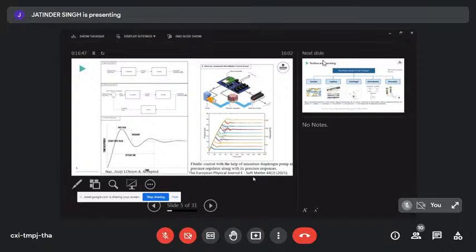And then on top of that, you've got the pulsative system, where this is for a pressure-driven system. If you've got a peristaltic pump, that overshoot happens every time the roller goes around. So you've got lots of pulses in your system. It would probably be a pain for HPLC because you really want to have a constant flow and a constant pressure. If you do flow injection analysis or just adding some reagents, it probably doesn't matter. So again, depending on what you do with your flow, having a large overshoot or a long settling time may be an issue, or may not be an issue.